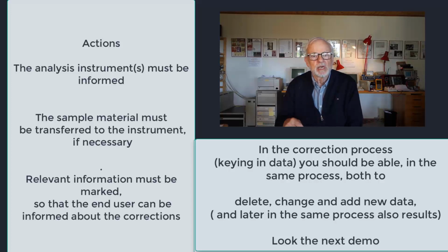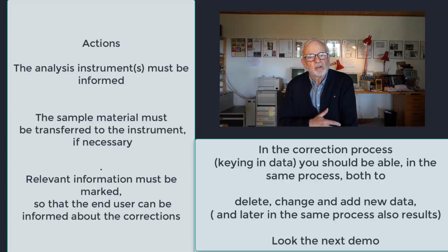Furthermore, the user can by several X get the result input form so they can put in the result if they have it already, so they can do it all in the same form if they are in a little stat lab. If reporting has occurred already on this requisition, the information will be marked.